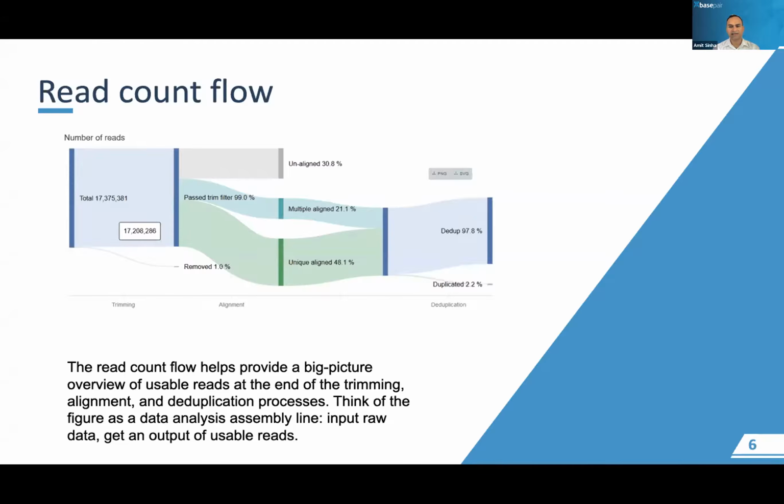If there is excessive PCR duplication, then the duplicate rate will be very high. So then you would want to reconsider your assay and the number of cycles you're running to reduce that number. So it is very, very advisable, before you trust the downstream results, to actually look at these figures and understand the whole data analysis workflow, just to make sure the numbers are within accepted range.